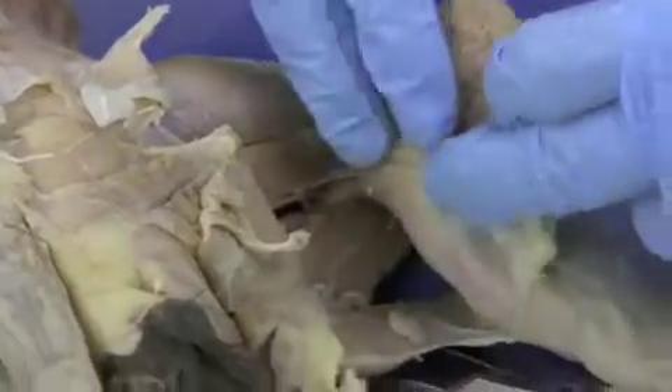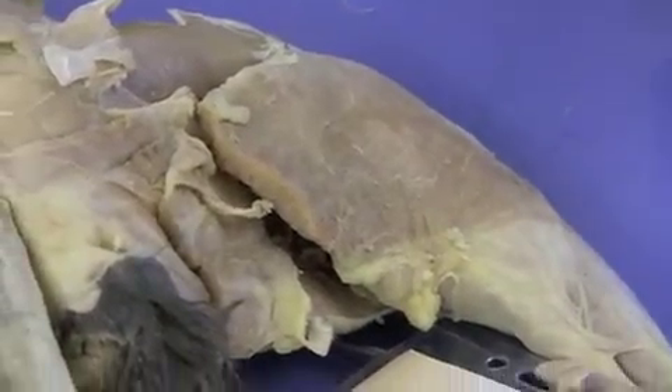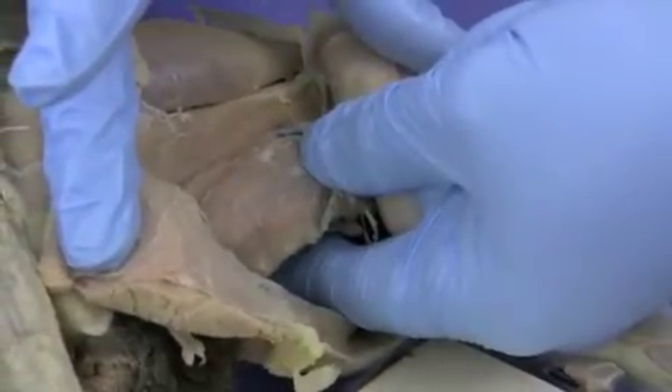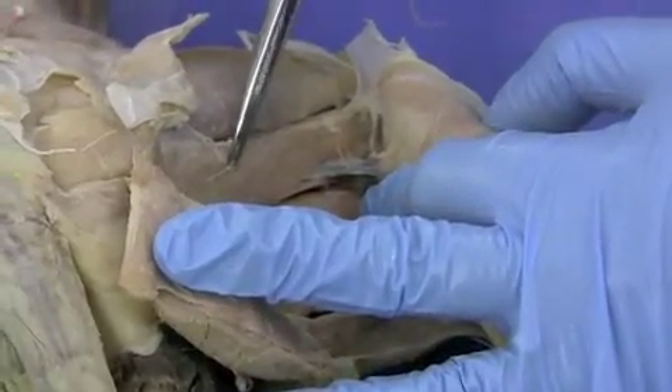Now you can see the biceps femoris on the back. So to reiterate, the hamstrings group, which helps to extend your thigh and flex your knee, consists of the biceps femoris, which has been transected, the semitendinosus, and the semimembranosus. You can also see on the back of this thigh, this is part of the adductor group here.